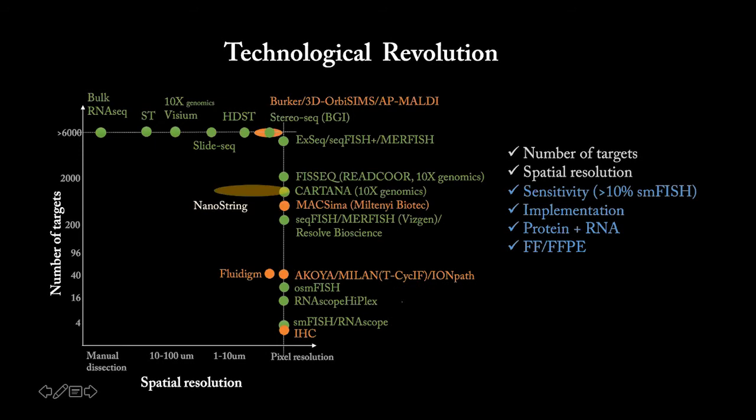For example, we were interested in whether the protein aggregation happens in a certain microenvironment, like amyloid plaque, or whether there's a phosphorylation of the protein, like tau, or some kinase involved in necroptosis, or granulovacuolar degeneration. And furthermore, immunohistochemistry can further help us to realize the morphology of the cell, whether there is hypertrophy of the glia, dystrophic neurons, and to count the number of synapses.